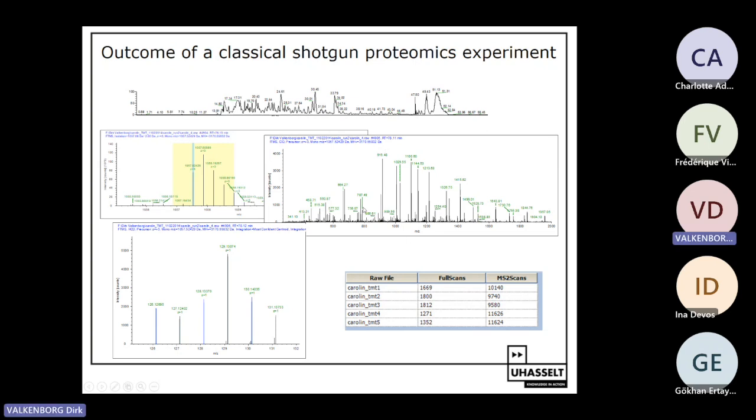Here you see a typical fragmentation spectrum. You see a lot of peaks here. These peaks are coming from the same selected peptide, but we have several copies of that peptide, which were broken apart. You can see all these fragment ions have different masses, and based on these different masses, we can now try to figure out which amino acid sequence we were looking at.